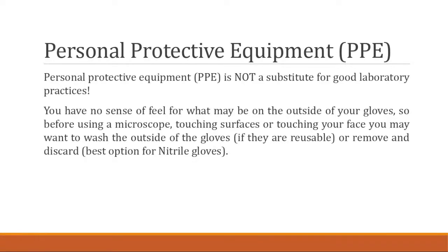Either way, if you are planning on using your gloves, it's always good to wash the outside of your gloves, like if you're going to be moving sample to sample, or when you're done, obviously the best option is just to discard them. Okay. And actually EH&S has a video on how you properly take gloves off of your hands.